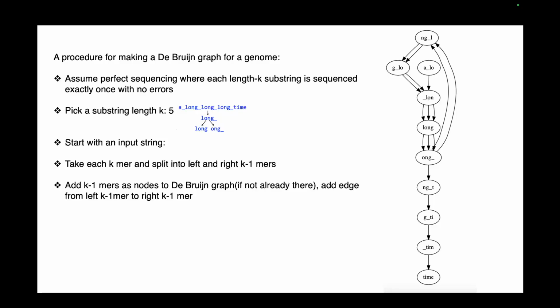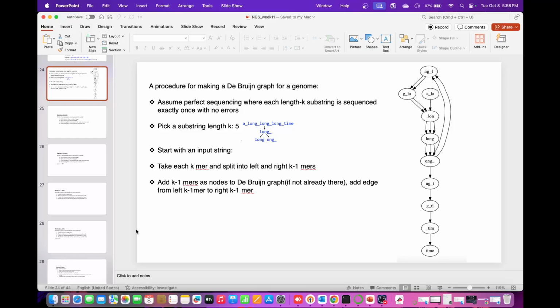And for each of the sequences, you can have multiple Eulerian walks, right? If you do the whole Eulerian walk from the source, this is your source, it starts from here, and this is your sink. From the source to the sink, you have to do the whole Eulerian walk, and you will have different possibilities. You have to check which possibility matches your conditions the most, depending on some sort of optimization technique. But you'll have multiple options. After doing the Eulerian walk, you need to get the best possible genome. So this is all about genome assembly that I had to say.